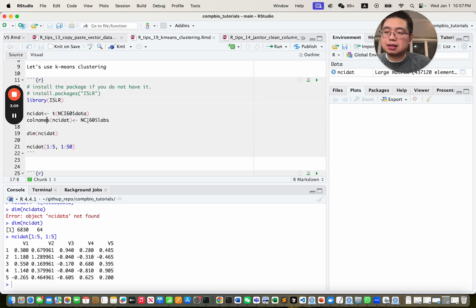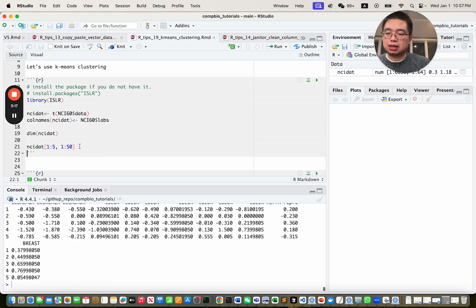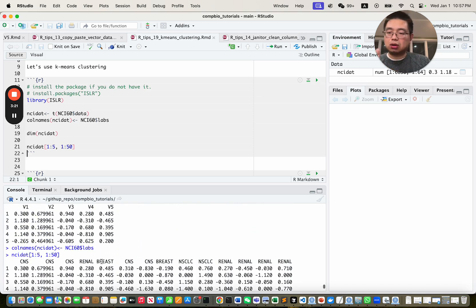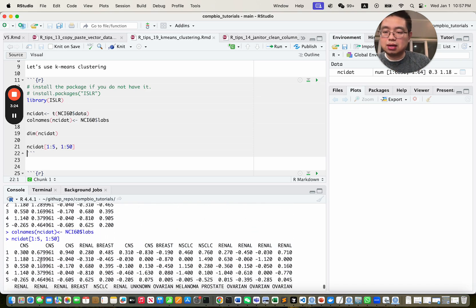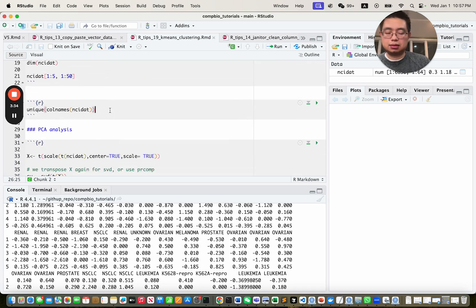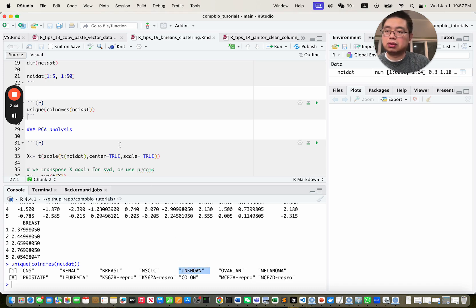It also has labels for each of the columns, the samples. This is gene expression data from different cancer cell lines. Rows are genes, columns are the cancer cell lines, and we know what cancer type each is — for example, leukemia or non-small cell lung cancer. If you look at the unique cancer types, there are 13 unique cancer types, plus one extra unknown.